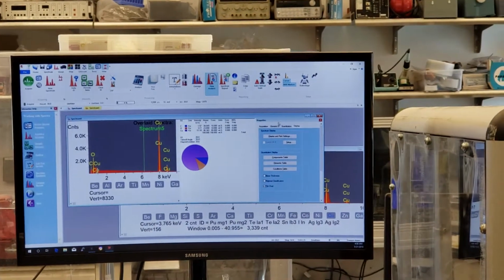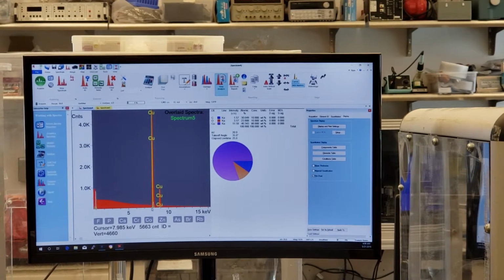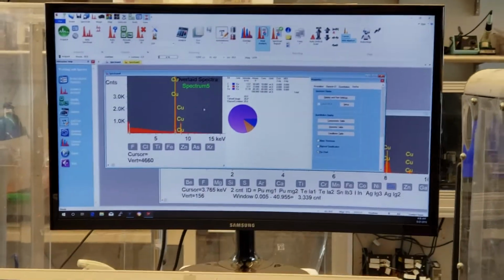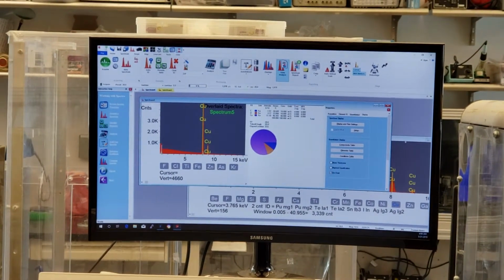So let me grab this window. So let me open this window up. So now I've got an overlay which is in green. It's very low because the percentages were very, very small. But I can overlay the other way. Let's go the other way. That makes a little better sense. Let me go control, left click that guy and drag him into there, let him go. Okay.